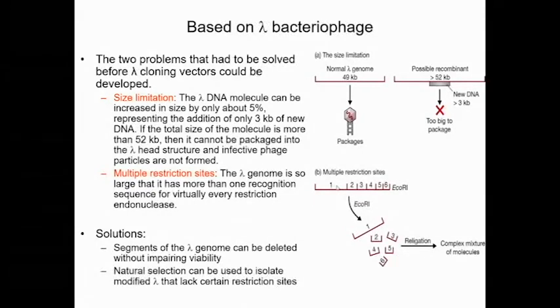All right. Therefore, the scientists need to re-engineer this Lambda genome, all right, to cut it. Number one, cut it shorter. Number two, eliminate several restriction sites.